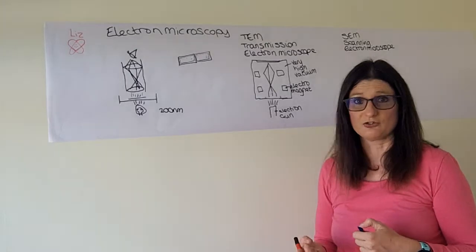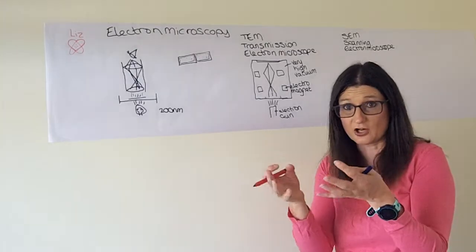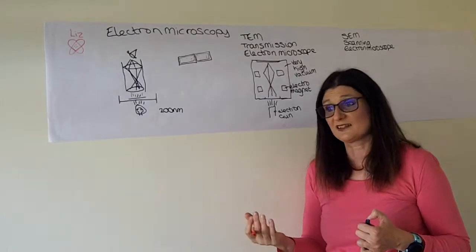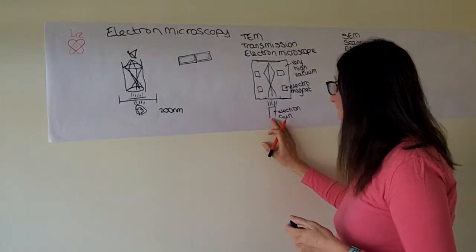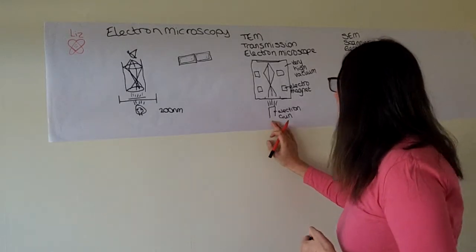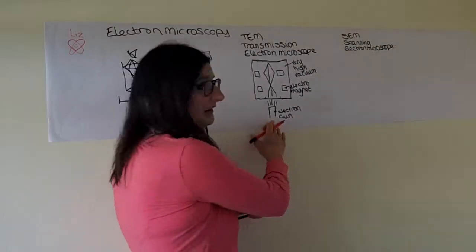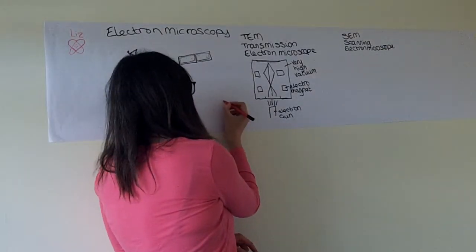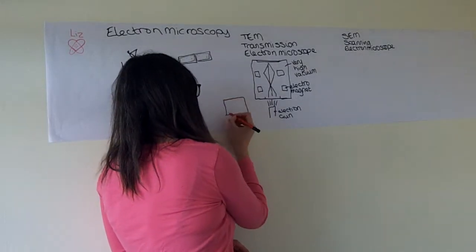And in biological terms, you can see the components of cells in there. So it's kind of as small as we could need to be able to see. So that's our transmission electron microscope, and you may have seen kind of pictures of cells that look something like this.